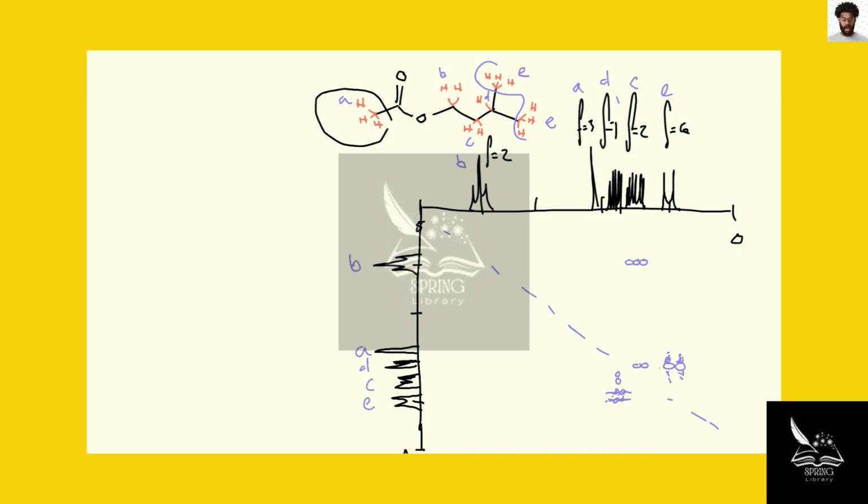Next, we're going to look at A. Who's A talking to? A is not talking to anyone, so we will get a signal at the confluence of A and A on this line, but that's it. In fact, everything talks with itself to some extent, so anywhere there's a signal, there's going to be a spot on the line, but we pretty much just ignore those.